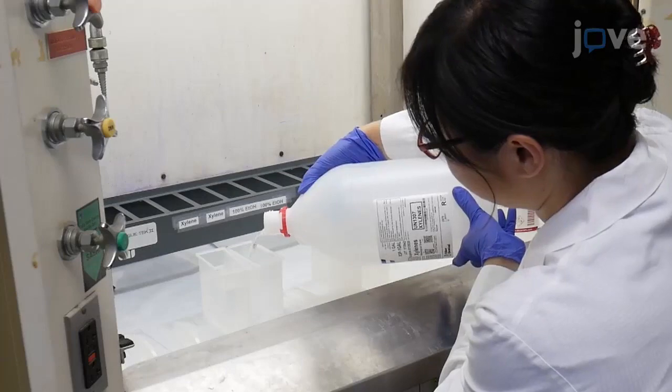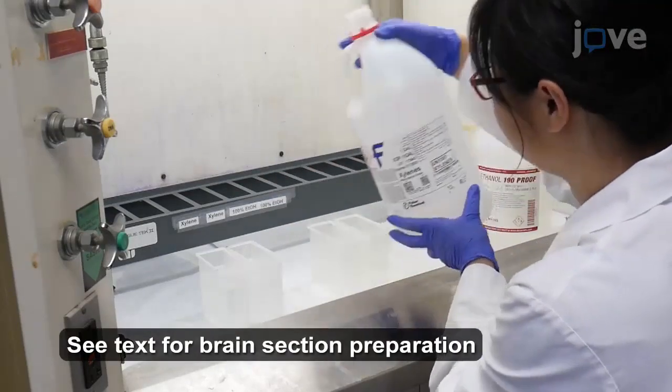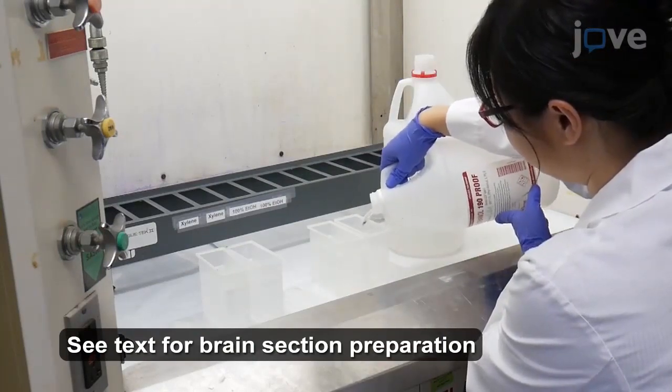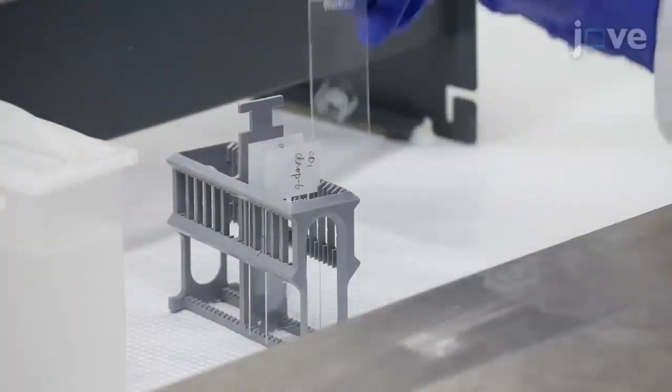To start mouse brain section deparaffinization, fill 2 washing dishes with 250 milliliters of xylene and another 2 with 250 milliliters of 100% ethanol inside a fume hood. Insert the tissue slides into a washing rack.